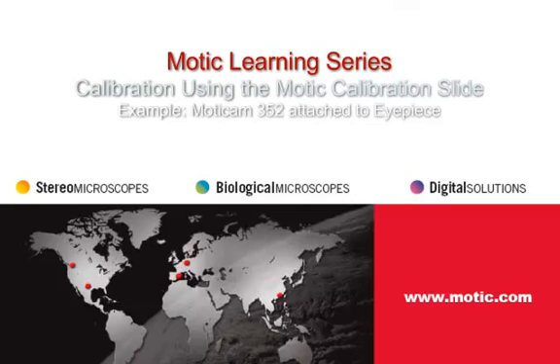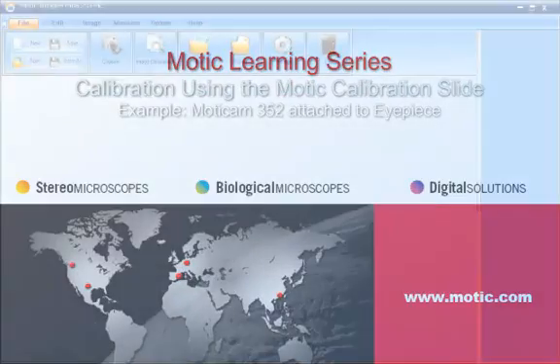Welcome to the MOTIC Learning Series. Today we're going to talk about calibration using the MOTIC calibration slide.